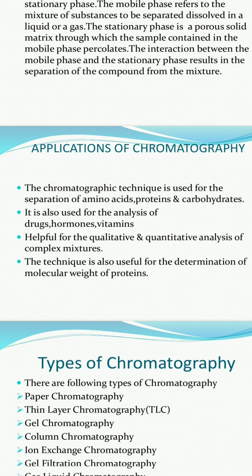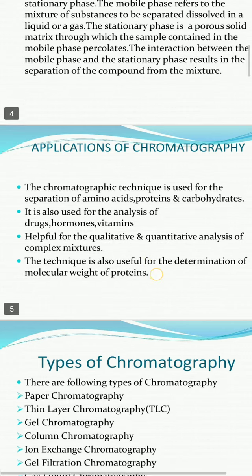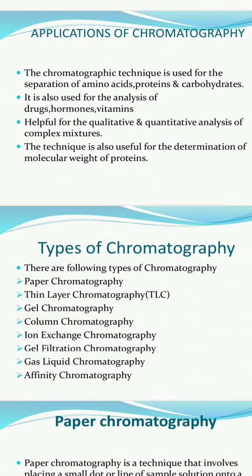So on the basis of weight of the protein molecule, the various types of proteins are separated, identified, and purified. Okay. So now come to the types of chromatography.